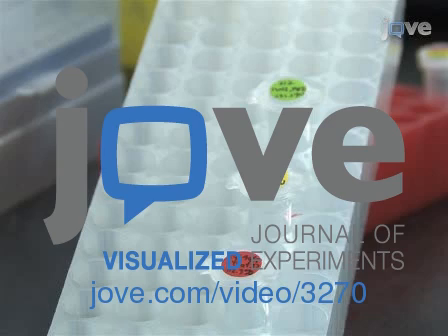Replace the needle back in the idle position. Add a drop of M9 buffer to rescue the worm. Using some OP50 bacteria on a pick, touch the worm with the OP50 such that it sticks. Now transfer the worm onto a plate seeded with 50 microliter spots of OP50. Store the injected worms at 20 degrees Celsius for roughly 4 days to lay and grow F1s.